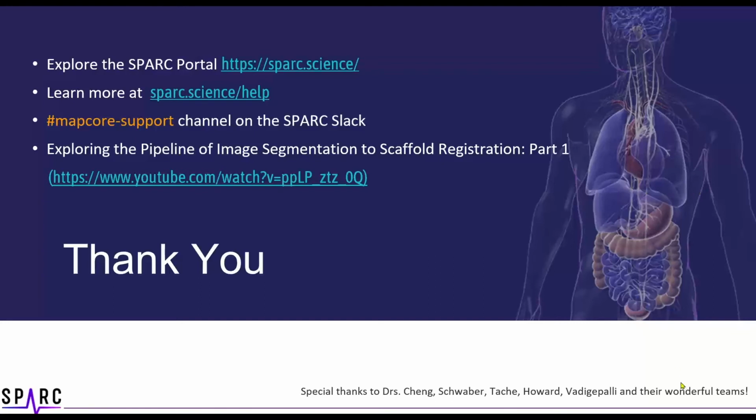Hello everyone, I'm Li Wang. Thank you for the presentation and very nice images and the settings. I just wonder, with all the wonderful images, if the readers want to know what the image was showing, the structure, for example, the two color-coded groups of cells, what kind of cells are they? It's only looking at an image without labeling the structures of cells. It's hard for people not working on the subject to know what the contents are.